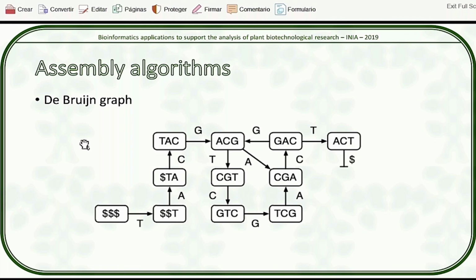You're not actually comparing the original sequences between each other. You're not doing that pairwise comparison. You're just looking at the k-mers, and seeing in the network that is being generated as you chop the reads into k-mers what connections you start seeing. It gets really messy. The shorter the k-mers, the more connections you're going to find. And the more connections you find, the more difficult the layout in the end, the more difficult to find the actual path.